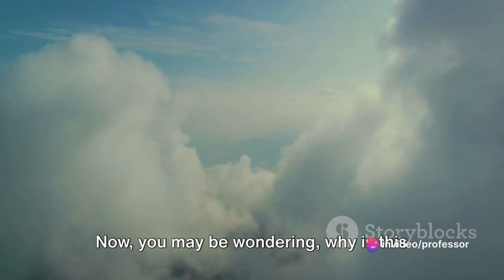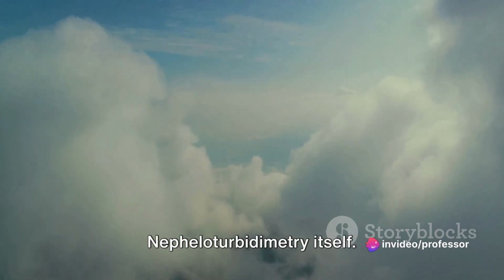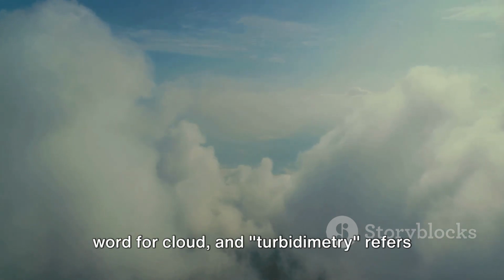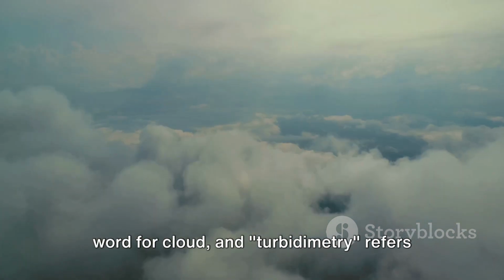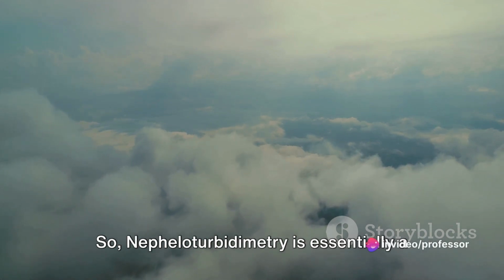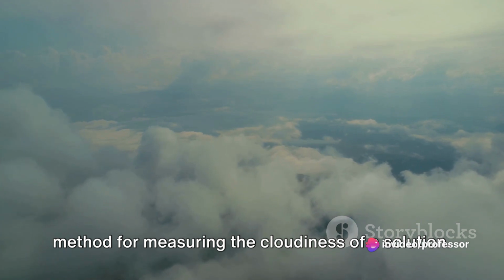Now, you may be wondering, why is this important? The answer lies in the name Nepheloturbidimetry itself. The term nephelo comes from the Greek word for cloud, and turbidimetry refers to the measurement of turbidity or cloudiness. So, Nepheloturbidimetry is essentially a method for measuring the cloudiness of a solution.